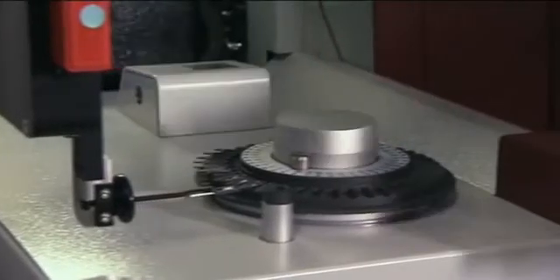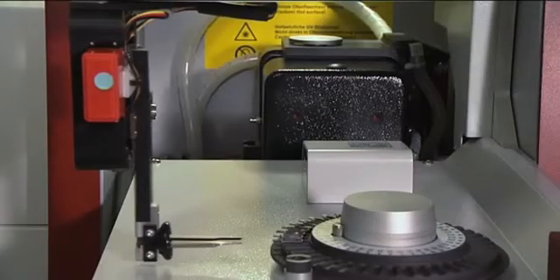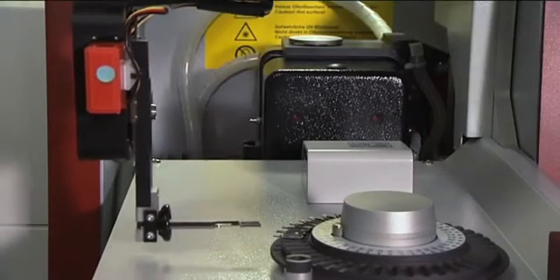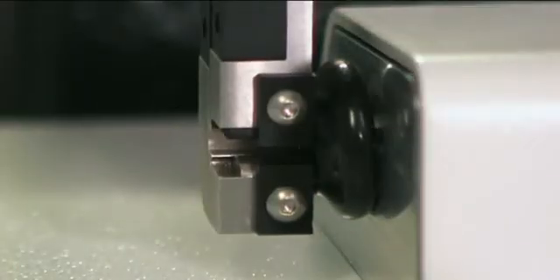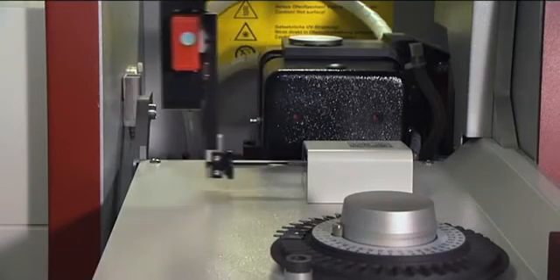The samples are measured out by hand on reusable graphite platforms. The robot arm of the solid sampler transports the platform to the integrated microbalance. Subsequently, the sample is transported into the graphite furnace. After the measurement, the platform is immediately ready for the next sample.